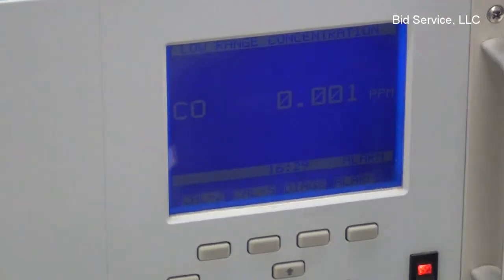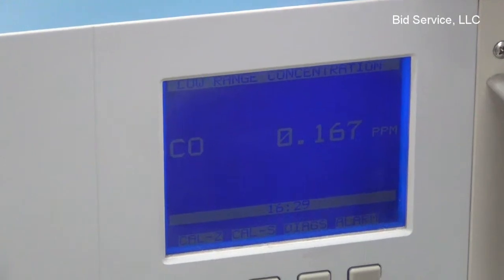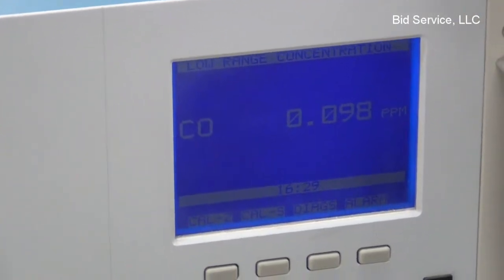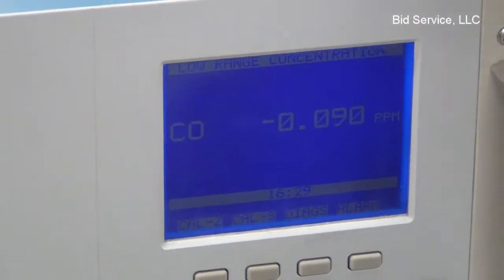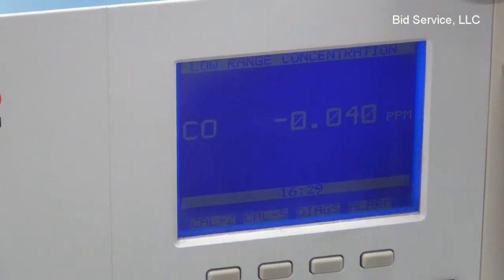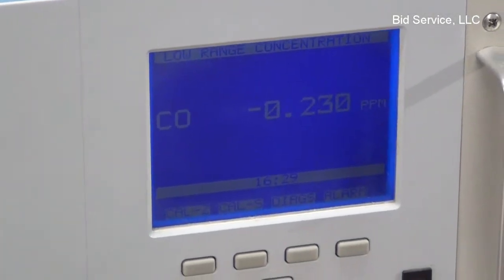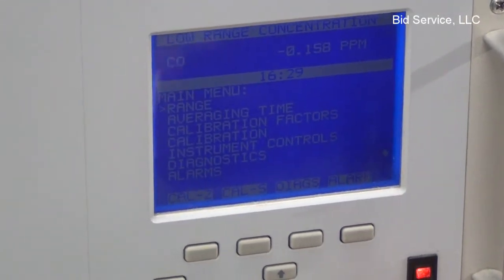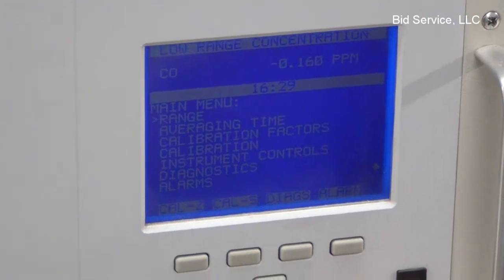After its warm-up period, it immediately starts to sample different concentrations and rates through the sample port in the rear of the equipment. The operation, calibration, and setup is very simple to use. It has simple, easy-to-navigate scroll-down menus for range, calibration, diagnostics, setting up alarms, and passwords.